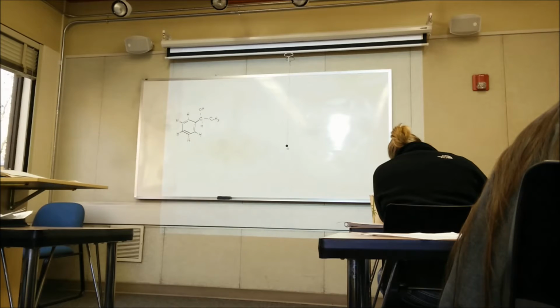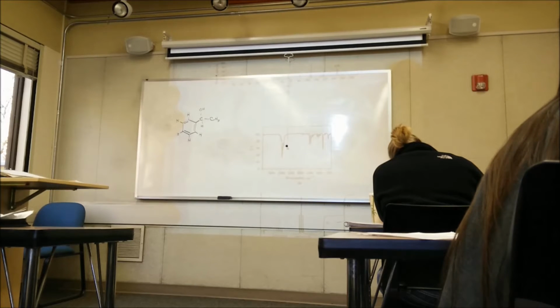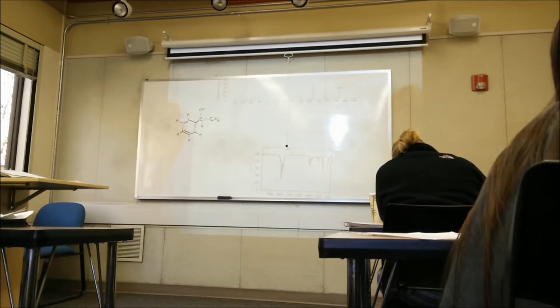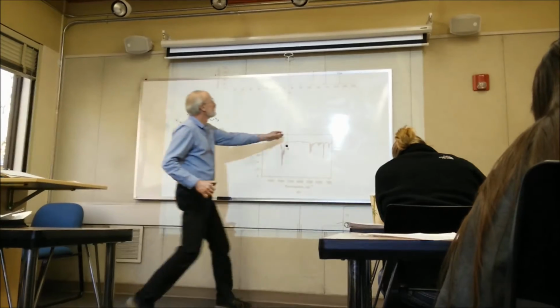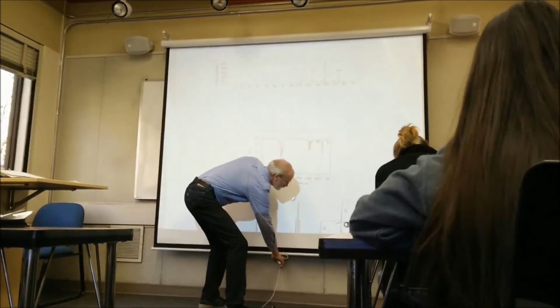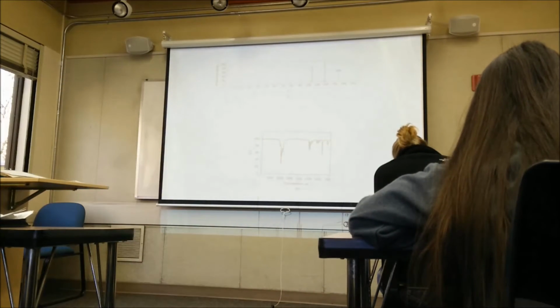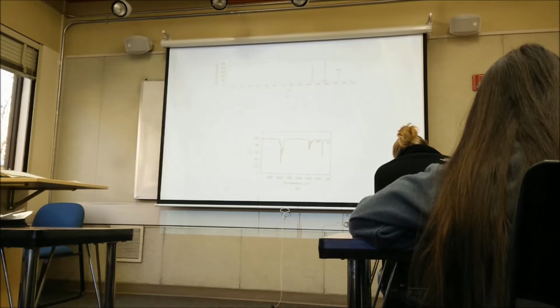So yeah. Compound 2. Mass spec, right? I had totally forgot about mass spec. Oh wait, that thing we did for like an hour. Yeah. So we don't get a molecular formula. We have the molecular weight, that's right. So 134.